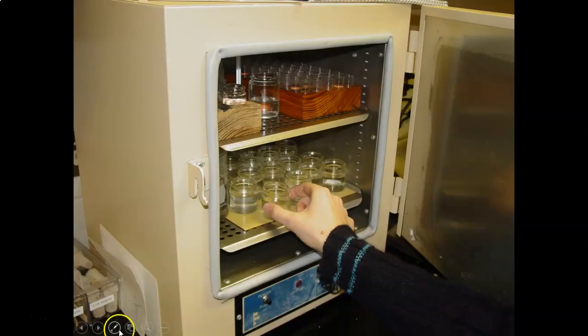Next, let's look at this picture. This picture contains the oven with a temperature of 55 to 60 degrees centigrade, xylene here in a liquid form, and paraffin here will replace the xylene.